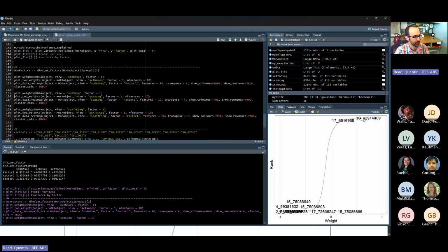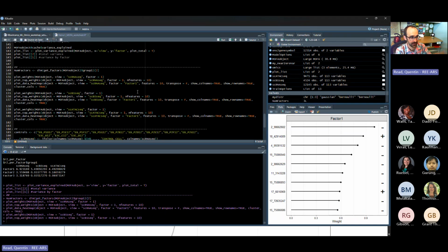You can see, okay, here's a few genes that are highly methylated in high values of factor 1, and here's some genes, or some loci, that are highly unmethylated in high values of factor 1. Line 156 just shows that in a different way by looking at these weights. And it makes sense that there's a lot more low methylation in the stem cells because that's where a lot of biological activity is going on and a lot of genes are being expressed, so they're not methylated, right?